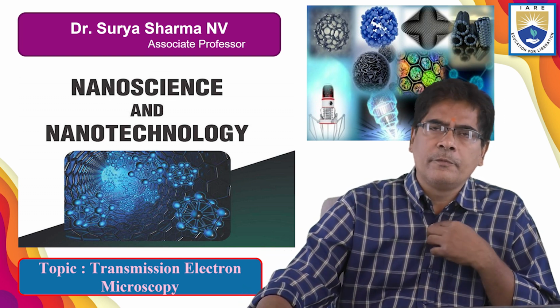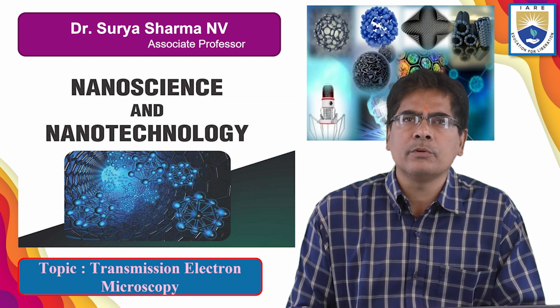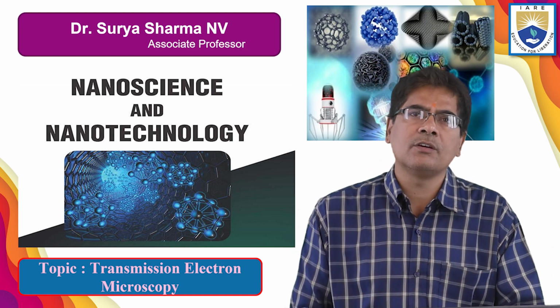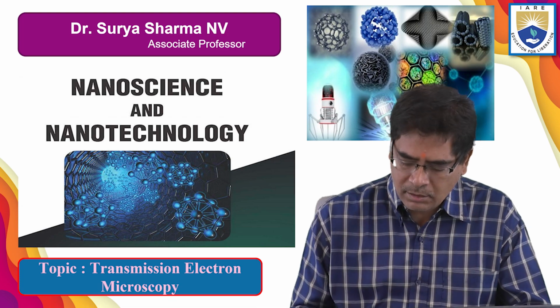Right. So the nanomaterials are fabricated by using different processes like top-down and bottom-up approaches. In today's session, we'll see the characterization techniques. That means the materials which have been characterized by using XRD, scanning electron microscopy. And today we'll see what is transmission electron microscopy.